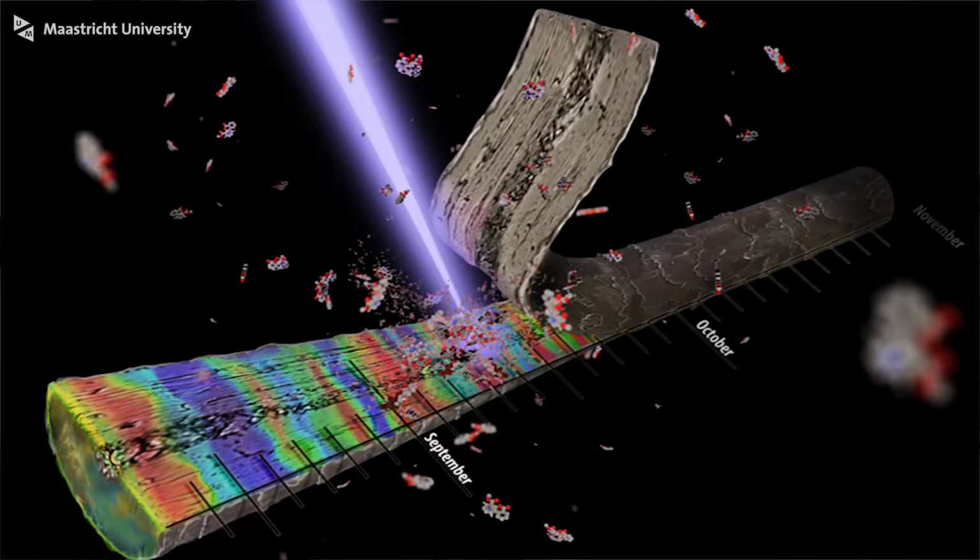Here at M4I, we use an enormously advanced infrastructure to make these molecular images. These molecular images constitute profiles of an individual, and one of my favorite profiles is the molecular profile of a hair. And a hair gives away your chemical secrets. It's like your molecular diary that shows you where you've been and what you've been exposed to. And with our high-end infrastructure, we can actually make these molecular images and visualize the distribution of molecules on surfaces. And that is actually what I'd like to show you in the guided tour today.